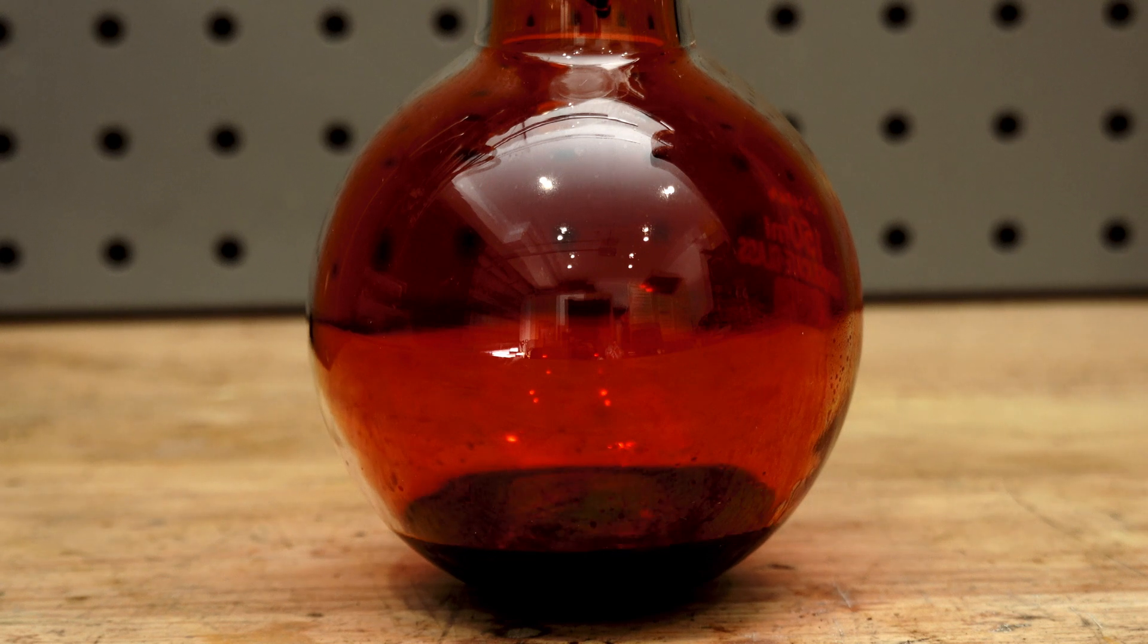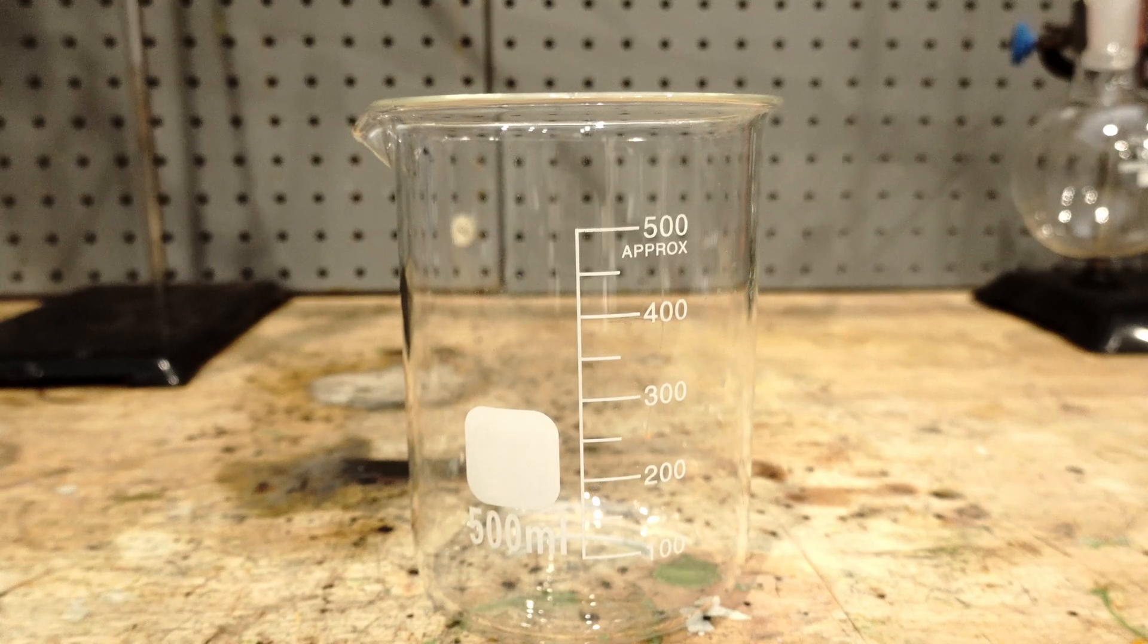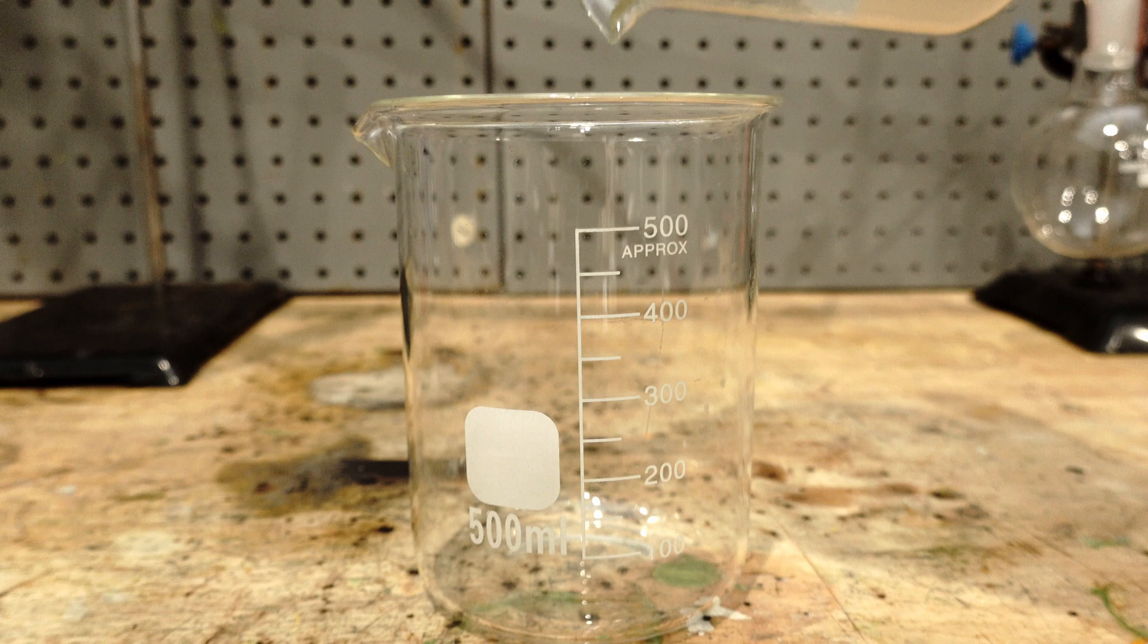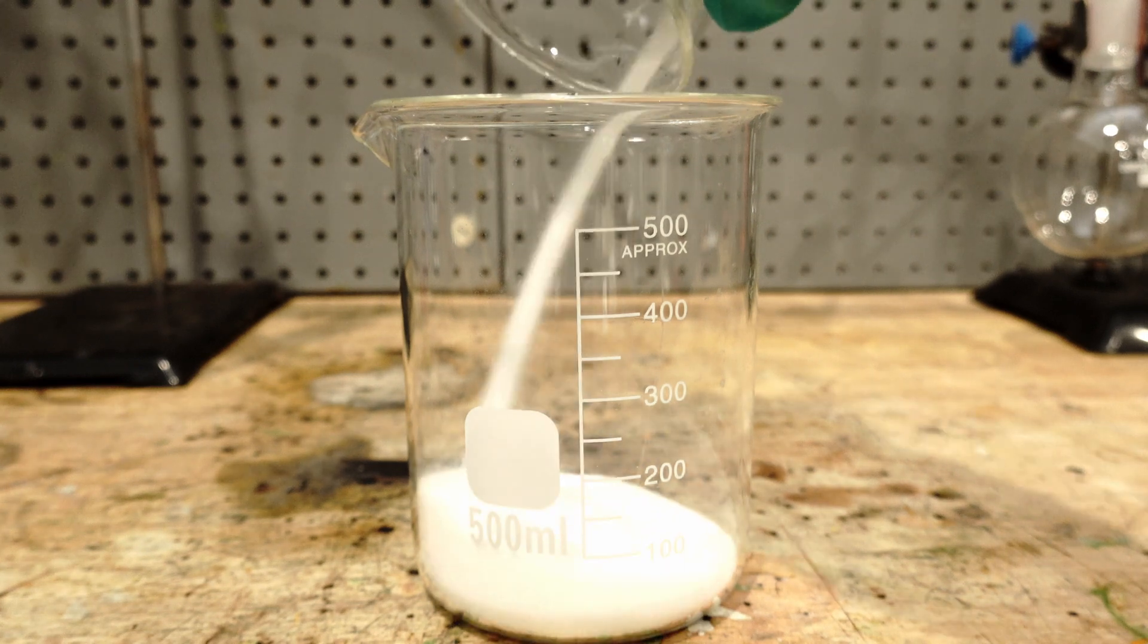Hello, and today I'll be making some Bromine. First I weighed out 153.5 grams of potassium bromide and added this to a 500ml glass beaker.